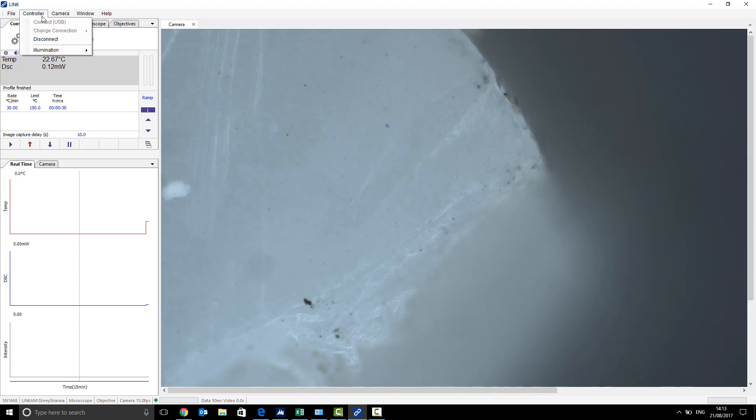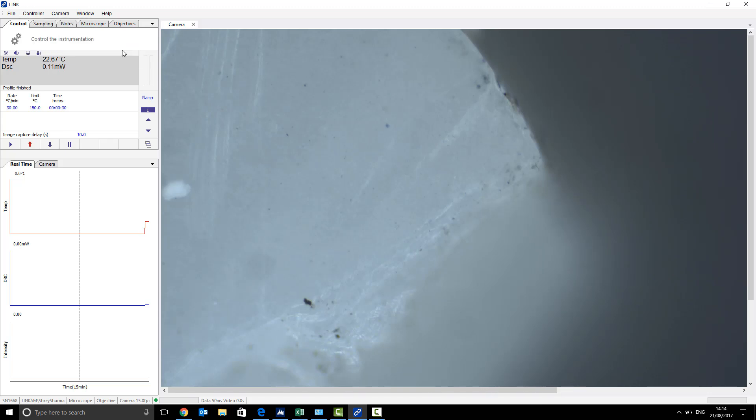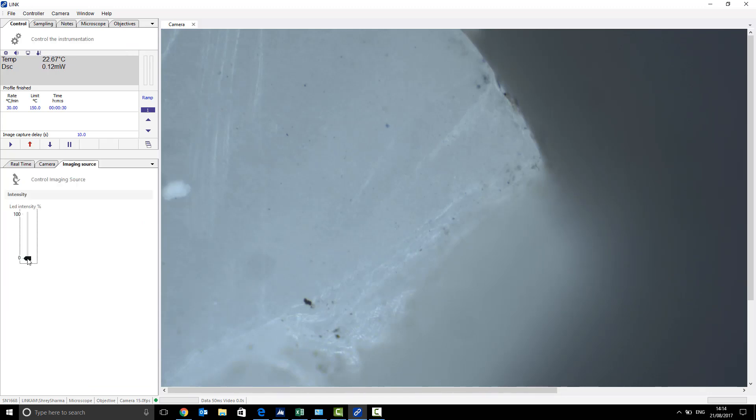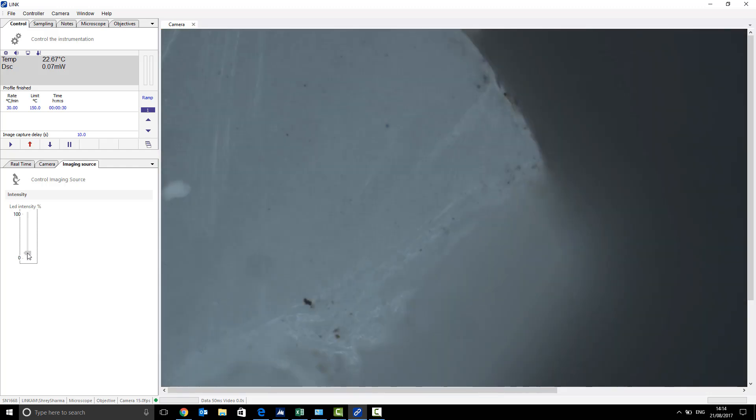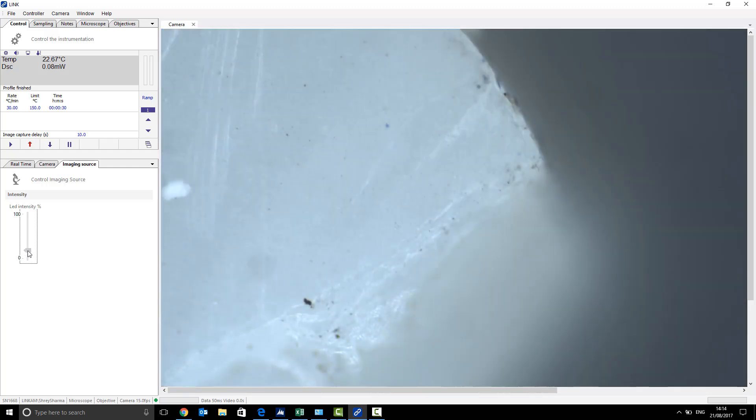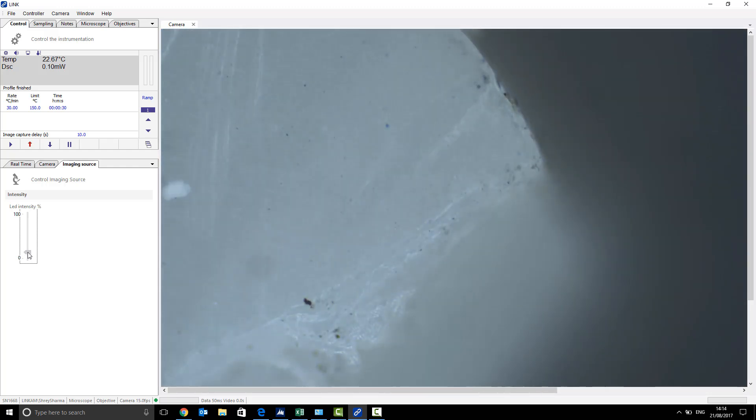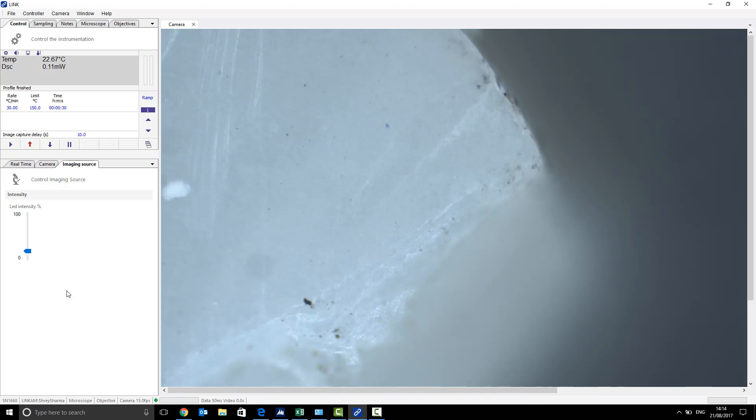you also want to connect the reflected light source, so on controller, illumination and connect, that will bring up the RLS 20, which you can adjust the LED intensity from zero to 100%. And once you have a good view of your sample, you want to just keep that there.